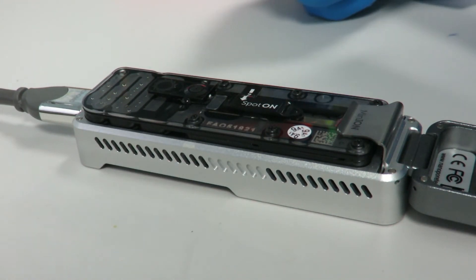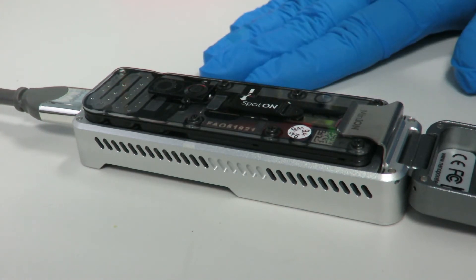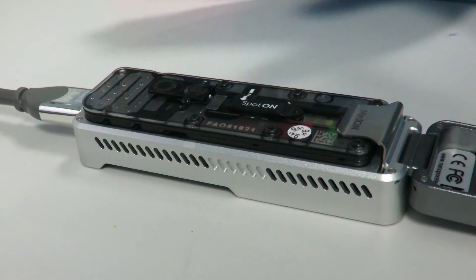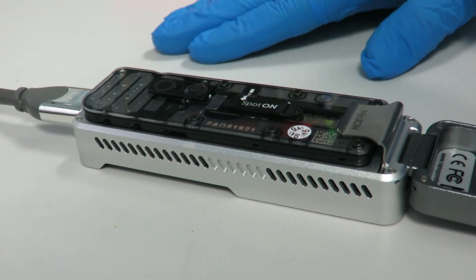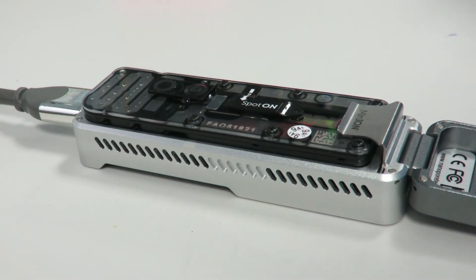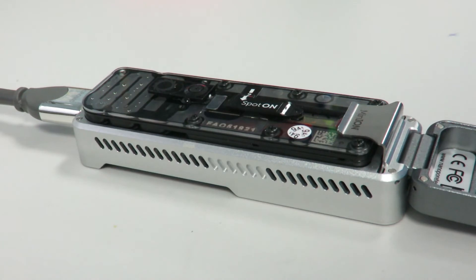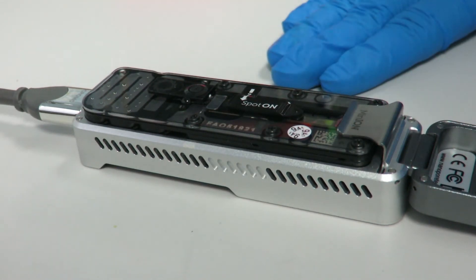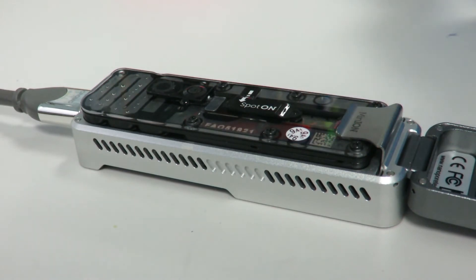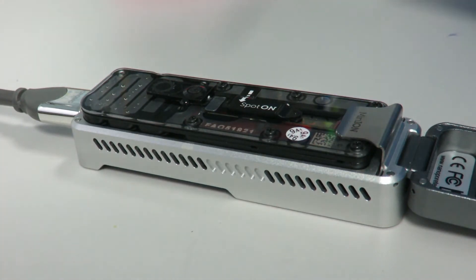It's definitely worthwhile QC-ing your flow cell once you've done the wash, because ideally you should have a sufficient number of pores to do another run. It's worth checking that you've got a decent number of pores. I'm going to assume this has been sitting for an hour and I've destroyed all of my old sample DNA, so I'm going to move on to the storage buffer section.